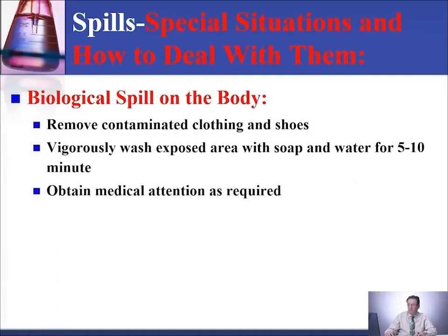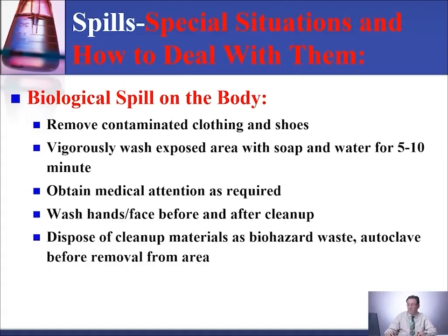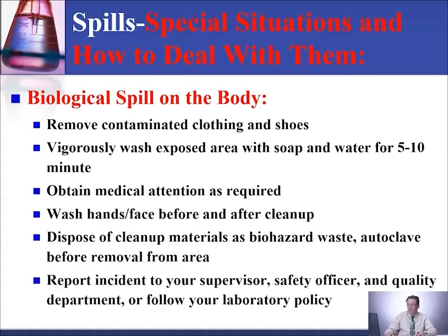Biological spills on the body. Remove contaminated clothing and shoes. Wash the exposed area really well with soap and water for 5 to 10 minutes. Obtain medical attention as required. Wash hands and face before and after cleanup. Dispose of cleanup material as biohazard waste, and autoclave before removing it from the area.